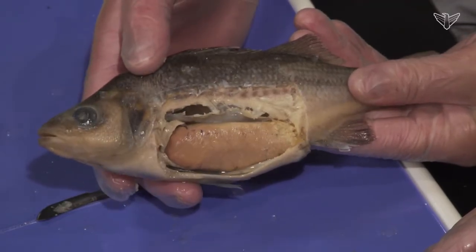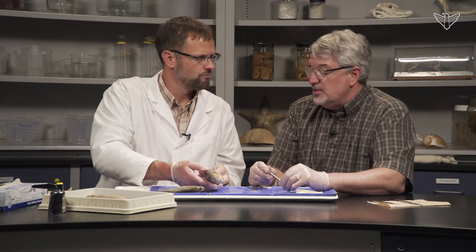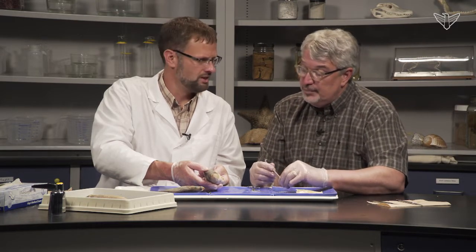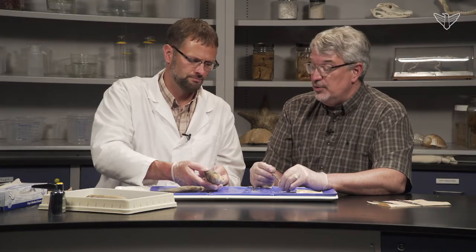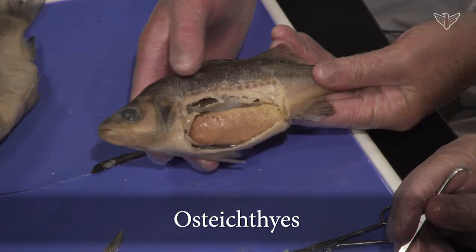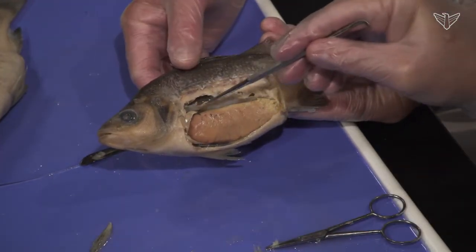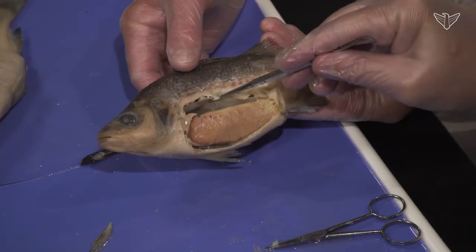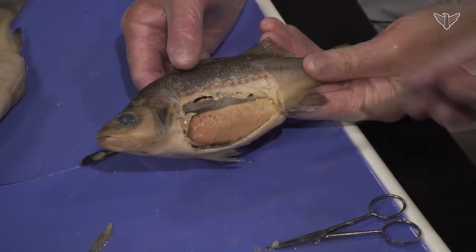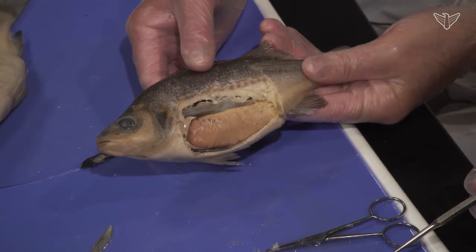That swim bladder was a very important adaptation that probably led to the success of this group. Sharks don't have a swim bladder — it's just these osteichthyes, the bony fish. The swim bladder is a sac coming off the digestive tract, and in later animals those air sacs evolved into lungs.